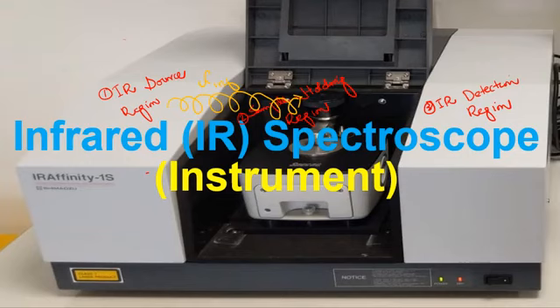The infrared radiation falls on the sample holding region, which is a region in which a sample is placed. The sample used in infrared spectroscopy is usually in the form of a liquid, solid, or gas.